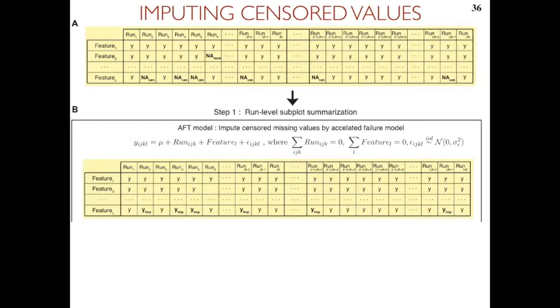As I say, I'm hand waving a little bit, as it would take a little more complication to explain exactly what it does. But essentially, it is better than assuming that it is missing, because, for example, if you assume that it is just missing, then it will be only influenced by the high intensity features, and low intensity features will not be part of this summarization. If we say that these values are missing and are low, then it reduces the overall summarization. Does it make sense? Or are you lost? Somebody wants me to repeat it in a different way? I need to have those yellow-green stickers. That would be good. So, really, okay?